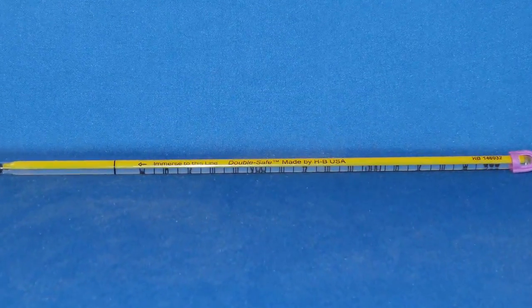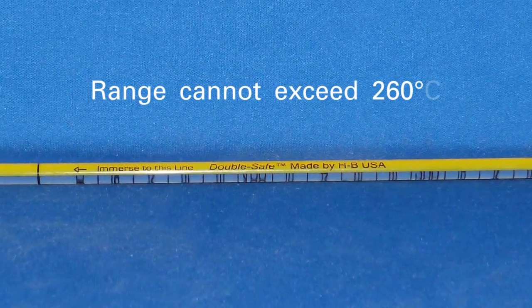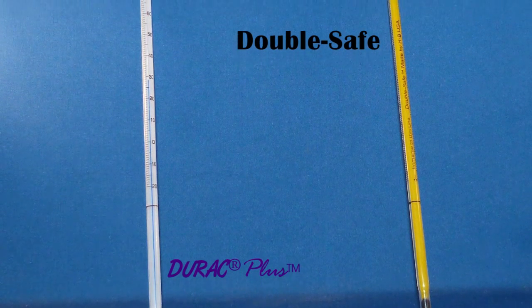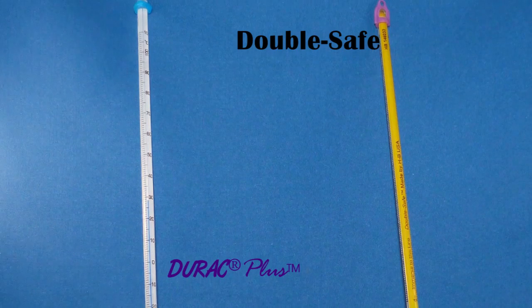Any glass thermometer can be PFA safety coated, provided that its range does not exceed 260°C. HB Instrument manufactures stock up Double-Safe thermometers and certain DURAC Plus thermometers that have PFA safety coating.